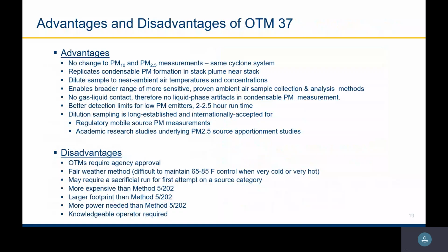We found if we could get it down to around 70 degrees, then it was sufficient to cool the stack gas, maybe at 500 degrees. It was sufficient to dilute that stack gas and keep it in the 65 to 85 degree range. On a really hot day, that can be difficult. A lot of ice is required to try to keep it there.